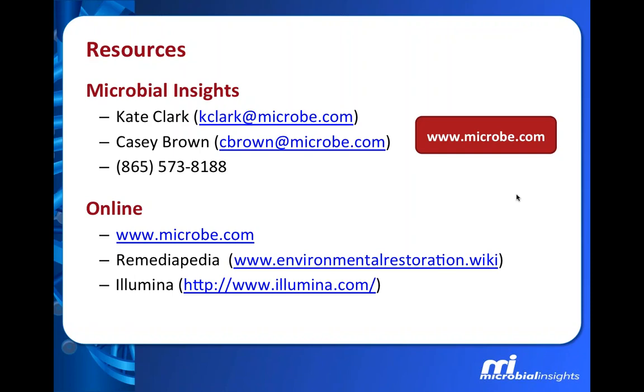I think most of the time, like in the case of the one before where the organisms are low, if it's not from a microbial ecology standpoint, then it may be a difficult DNA extraction, or it wasn't performed well, or we didn't get high quality enough DNA extracts to be able to perform the analysis. I think that's probably a bigger limitation than the actual amplification in that case.